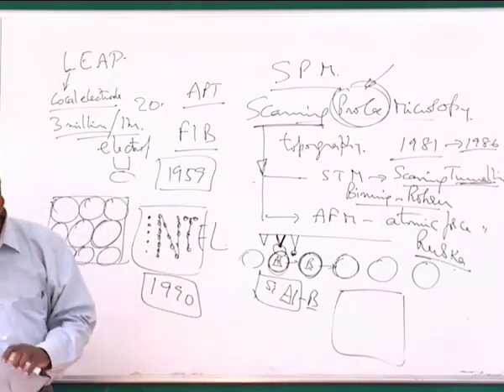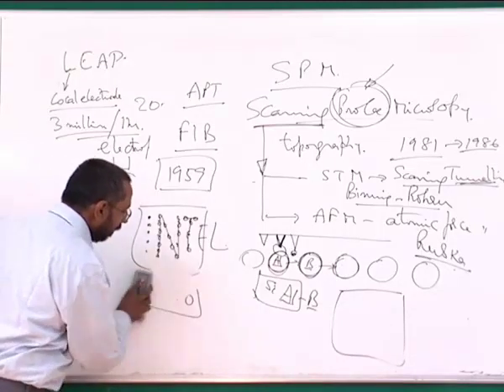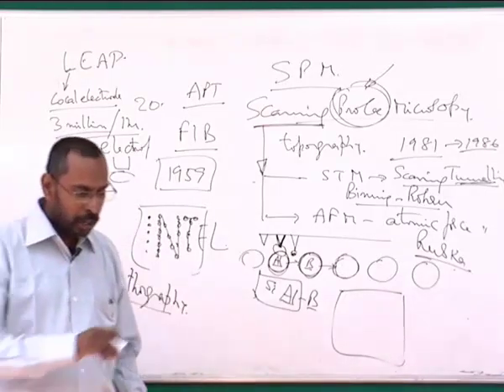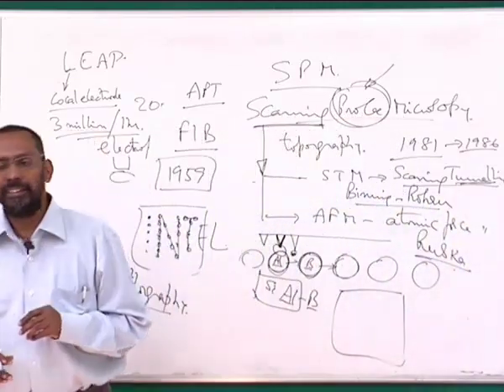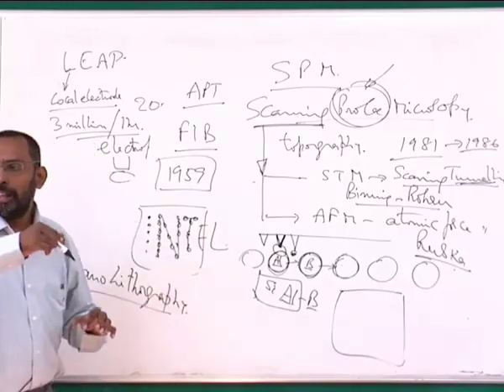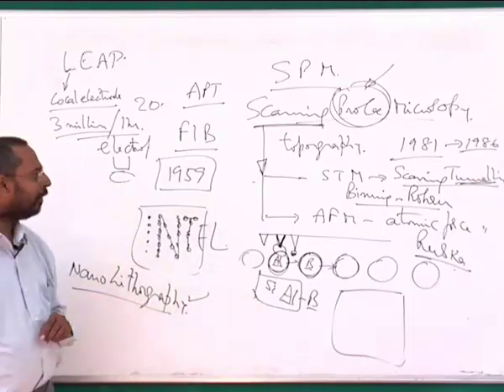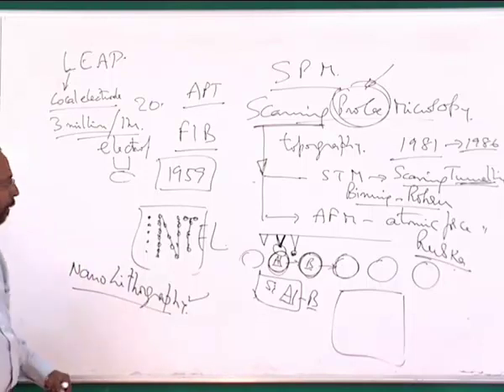This is one of the techniques which has become very popular, and people call this new technique of manipulating nanolithography, because you are writing. Lithography is a technique which you can use to write things. Because you are using this technique to write things, or drill small holes if you want, or create different structures that you want, people call this a lithography technique. So a variety of structures have been created by this.